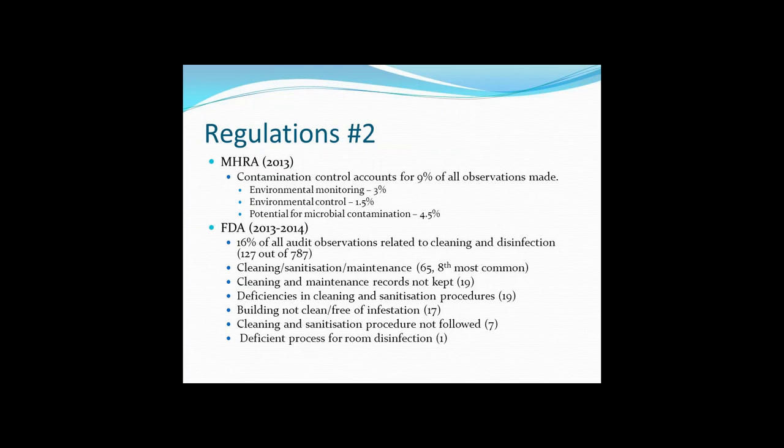So you can see from that list, and the previous slides, that there are a number of regulations that touch on cleaning and disinfection, and these areas feature quite highly from both UK MHRA and FDA. So covering a number of these areas will do you a lot of good if you are facing such an inspection.